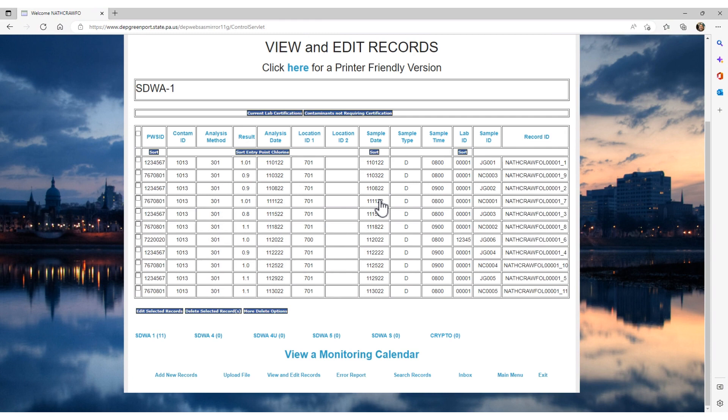If you would like to edit any of the records or even delete a record, click on which record you want by using the checkbox to the left of the PWS ID. Then either click the Edit Selected Record or Records button and you can edit the record or records as we just saw earlier in this video, or you can delete the selected records.